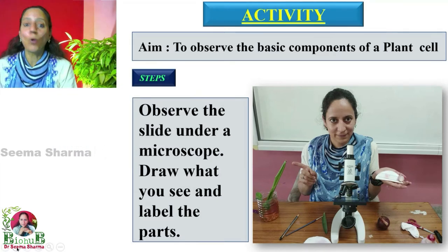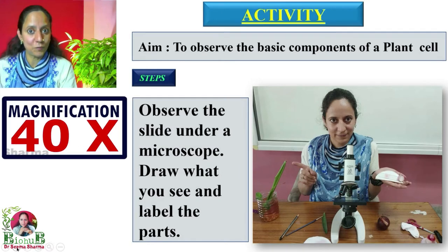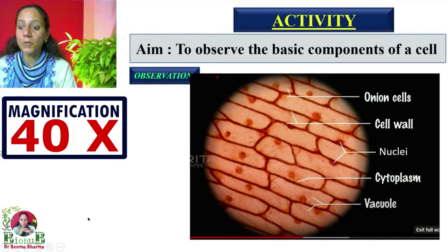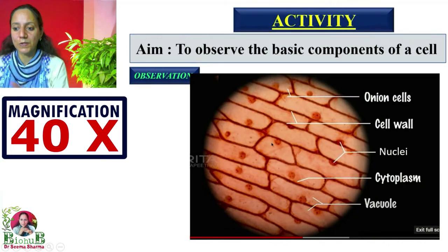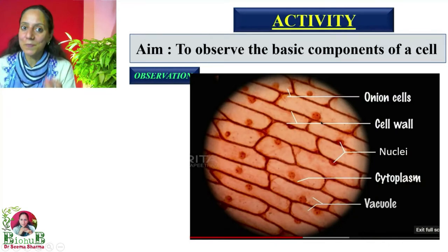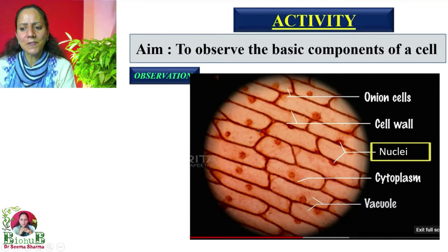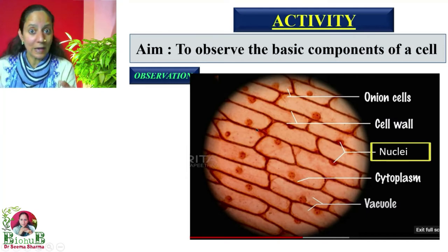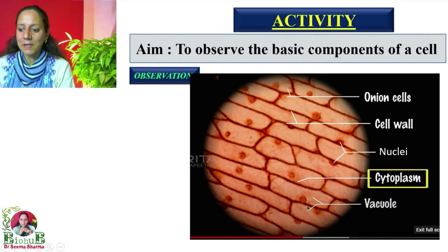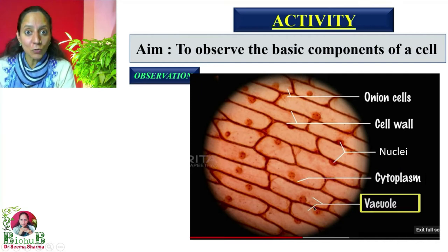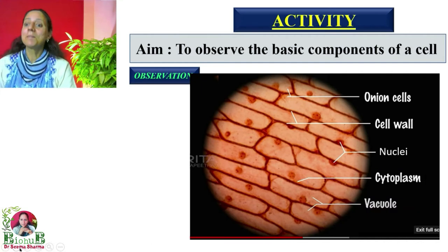When you observe this slide under the microscope at 40x magnification, you are going to observe: the outer thick cell wall, the nucleus — which will be visible somewhere in one corner — the cytoplasm, and even vacuoles, which will be visible very faintly.